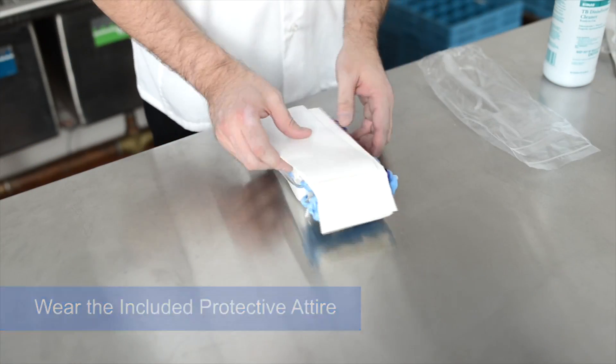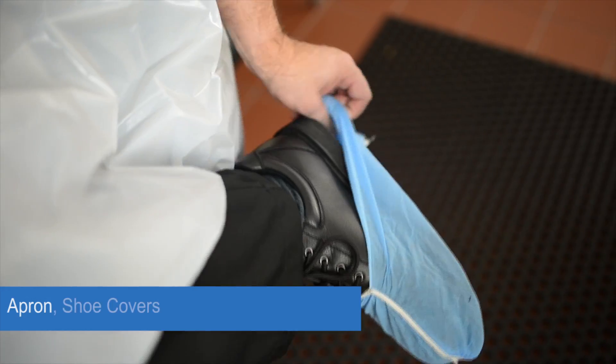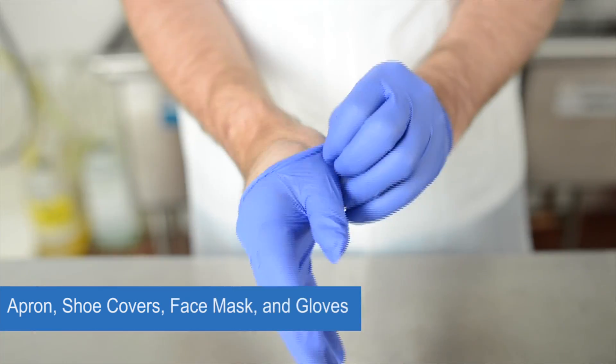Be sure to protect yourself by wearing the included apron, shoe covers, face mask, and gloves.